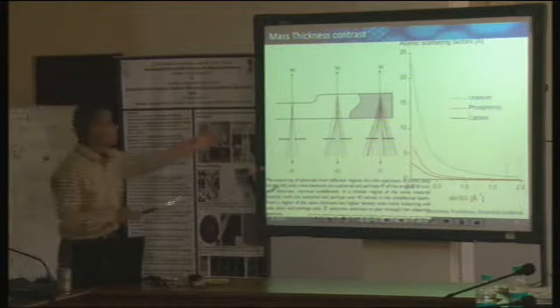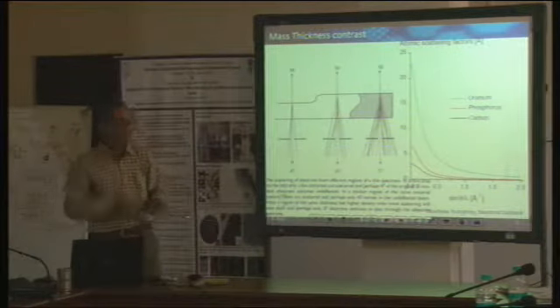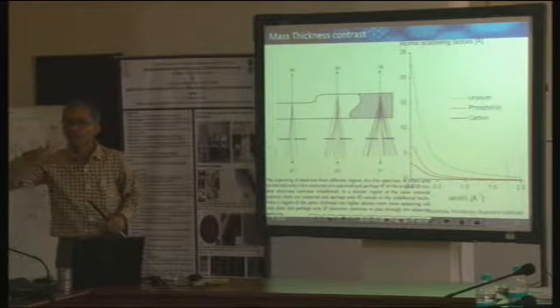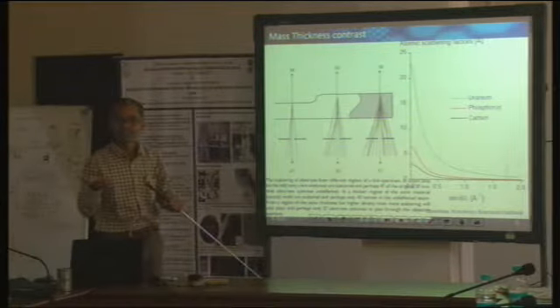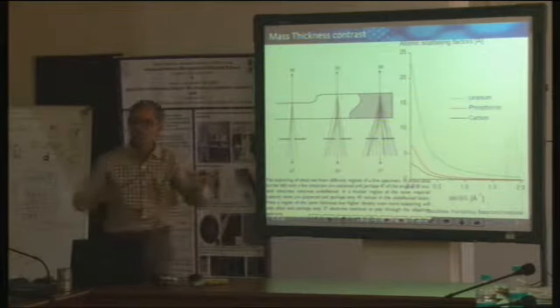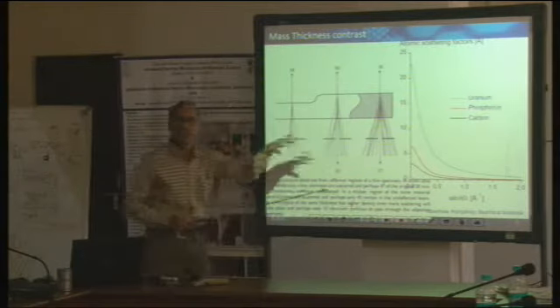Yeah, it means that this scattering happens, etc. We are not using this mechanism of getting contrast, depending upon how much scattering has happened, if we don't use the objective aperture. That's what is happening, isn't it? Because this thick region and heavy region will of course scatter, but we are not filtering out the scattered part.